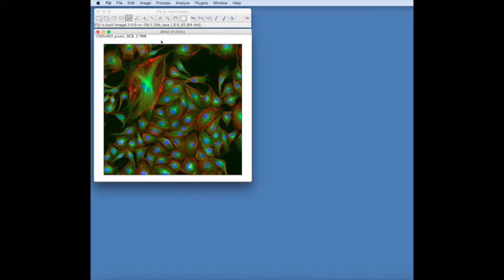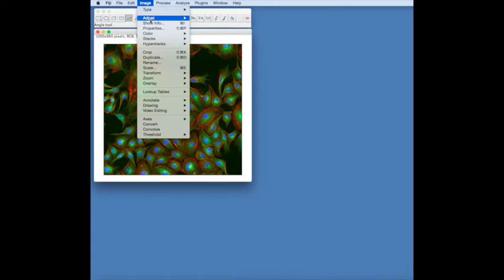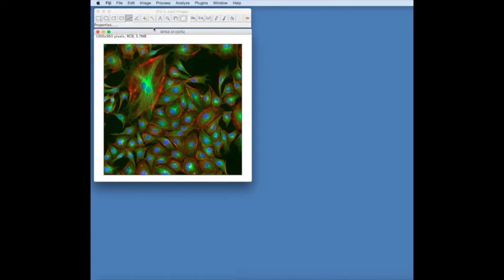This tutorial will take you through adding a scale bar to your image. As you can see, this image is calibrated in pixels rather than in microns.